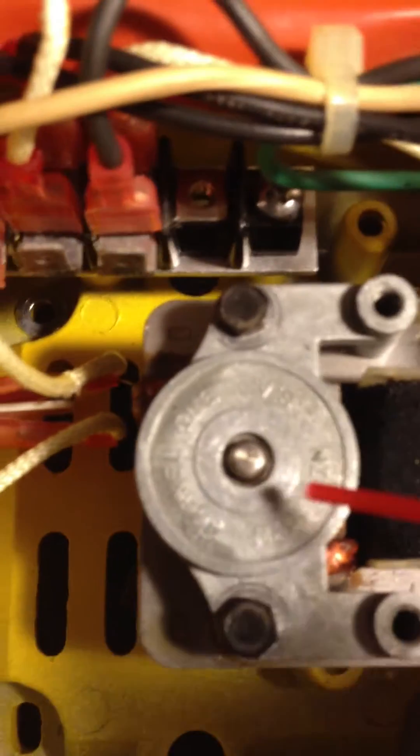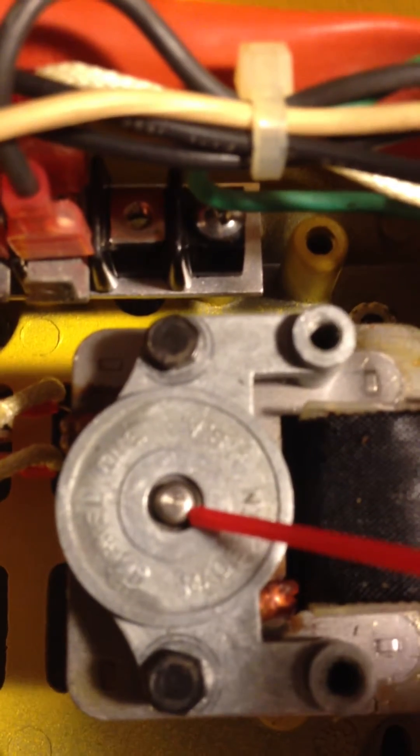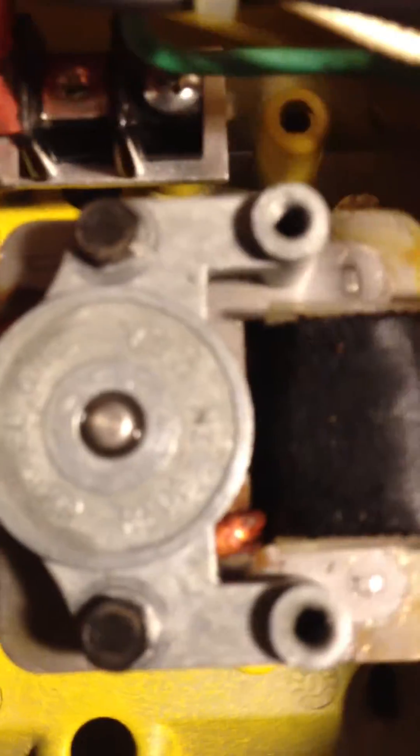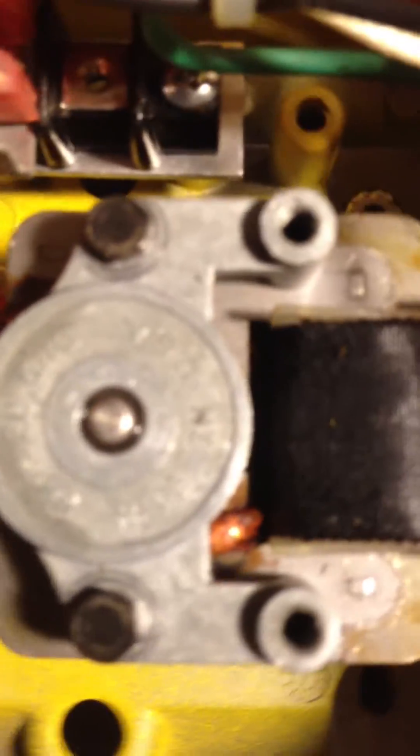So you just take your contact cleaner and you spray it in here, and you give it a few good twists. Try to get it all cleaned out. You probably want to turn it on and let it run for a little bit with the contact cleaner in there. Don't worry about the contact cleaner shorting anything out because it's not conductive.